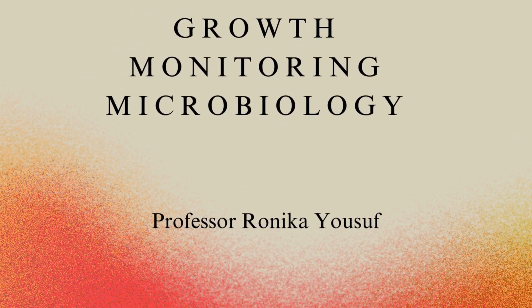Hello everyone, today we are going to dive into the essential topic of growth monitoring in microbiology. As you can see, this is a crucial practice for ensuring quality, safety and efficiency across many fields, from food and pharma to diagnostics. The constant challenge we face is that microbes have extremely fast generation times, which means we need frequent and rapid monitoring methods to keep up.